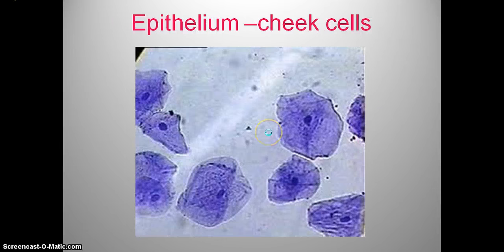Okay, now this is epithelium coming from the cheek cell. The cells are dislodged. Notice irregular shape, kind of irregular, but you could stack them up if you'd like to. What is missing obviously is the cell wall, because we're looking at animal cells. All the cells here come from animals, but definitely nucleus right here in the center and surrounding cytoplasm with cytoskeleton. All right.